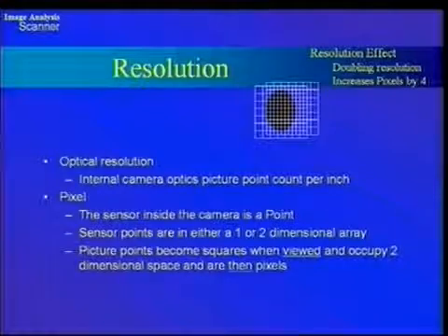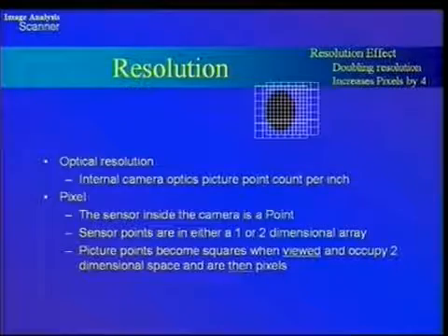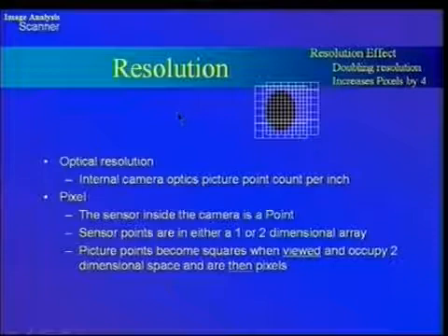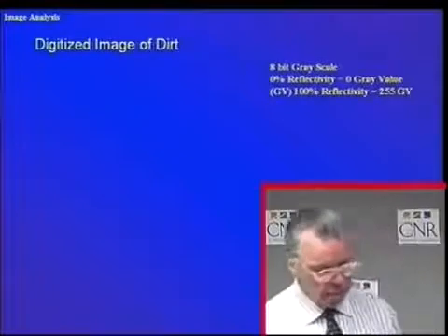For measuring with TAPI 563, a minimum of 1200 ppi is required. It really works much better at 2400 ppi. But remember, when you go up in resolution, the image increases in size dramatically.